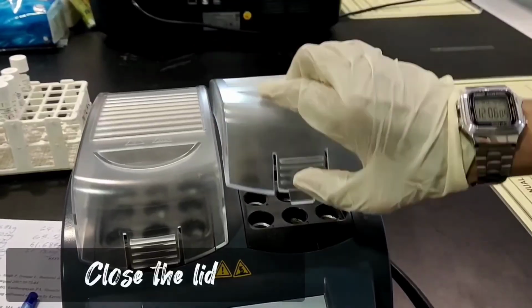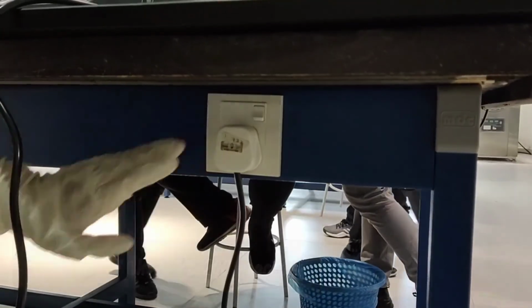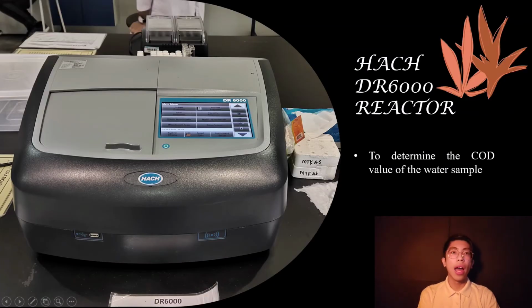Close the protected lid and switch off the DRB200 reactor. The last one is the DR6000 reactor. It is used to determine the COD value of the water sample. And then I will show you how to use the DR6000 reactor.